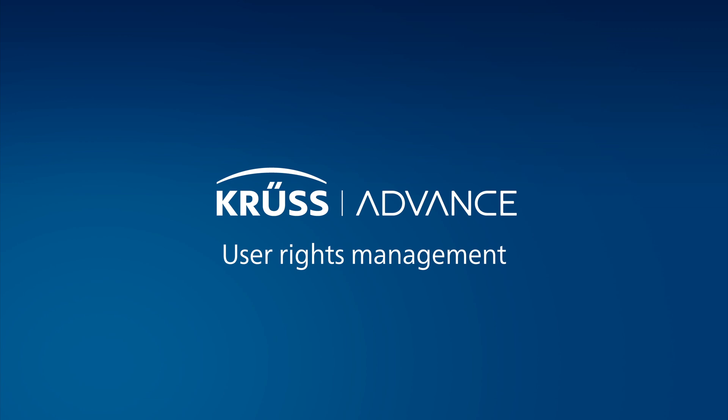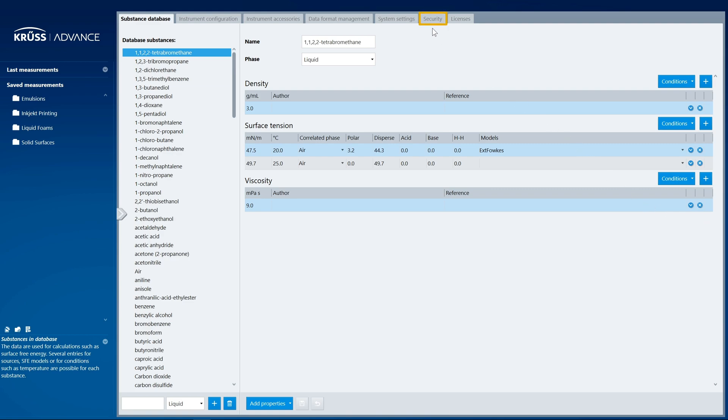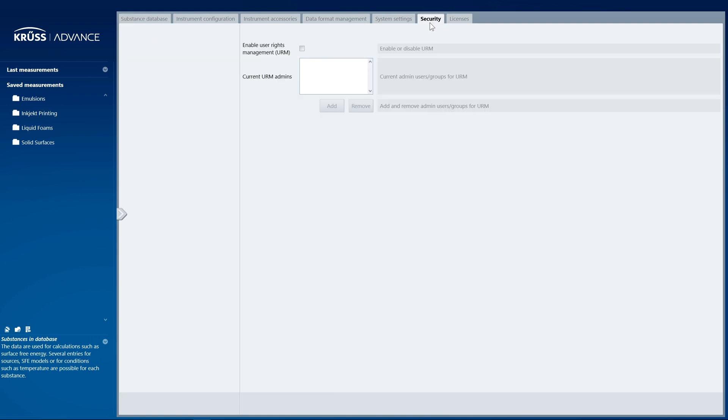The User Rights Management facility enables you to allow or deny individual users or groups of users access to measurements and folders. You will find this feature in the Settings area on the Security tab.